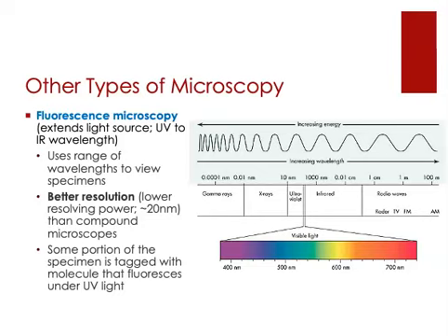Now, fluorescence microscopy can be very complex optically speaking, but primarily when we're using it for our microbiology needs, it looks a lot like a form of dark field because the background, the field, will be very dark, black even, and the object will have these very bright fluorescent colors.